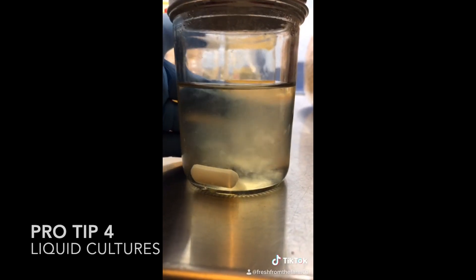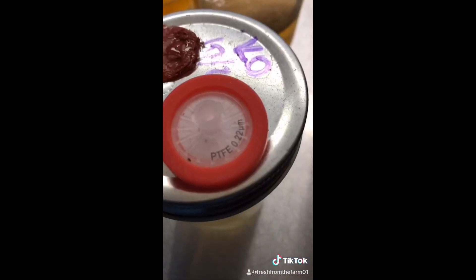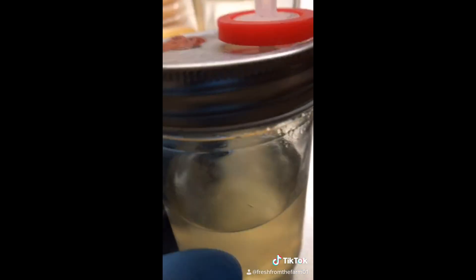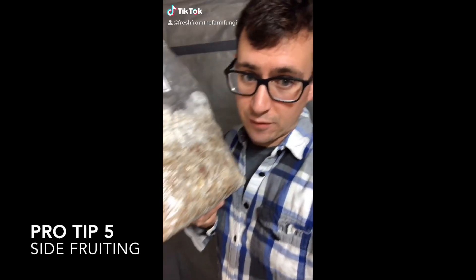Pro-tip: liquid cultures. Use a stir bar or glass beads to break up the mycelium. Wipe the injection port with alcohol. A 0.22 micron filter handles air as it's being displaced during transfer.